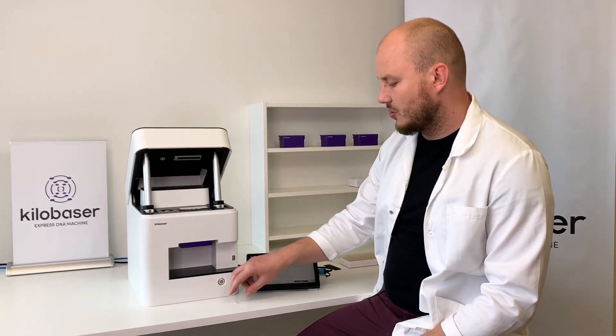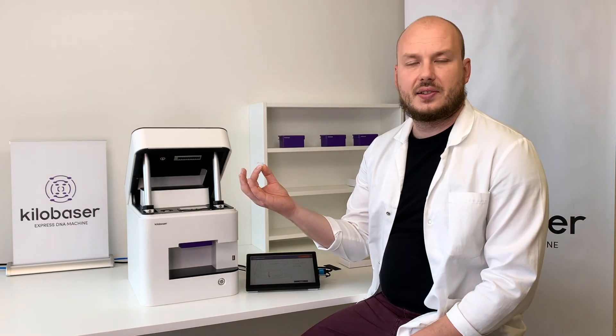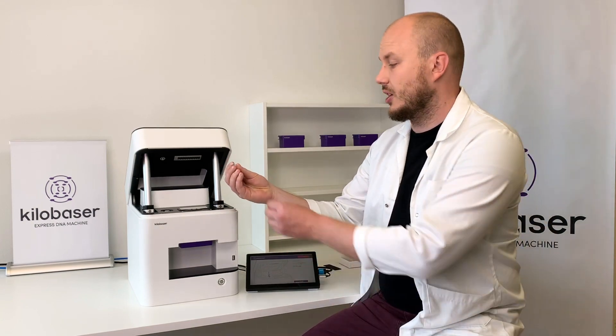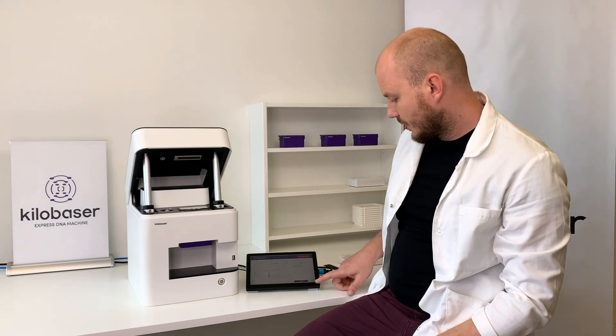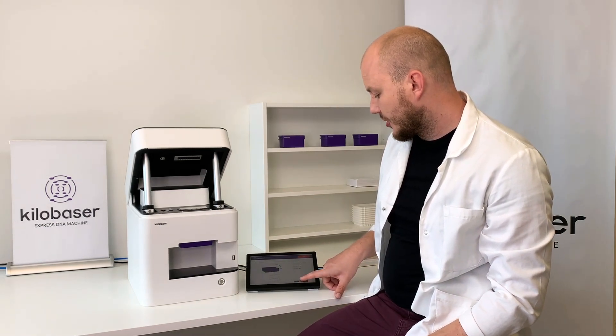It then tells you to enter the vial. This is a PCR-style vial — the DNA gets flushed into this vial when the synthesis is finished. You place it in here, press confirm again, and close the lid.